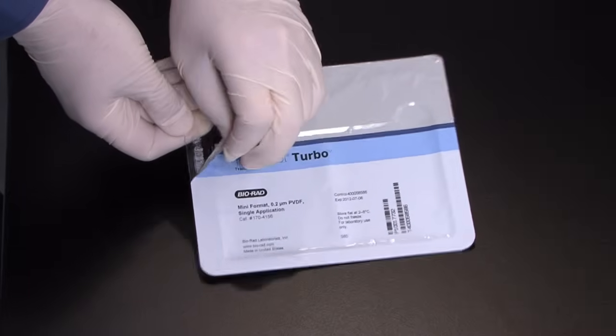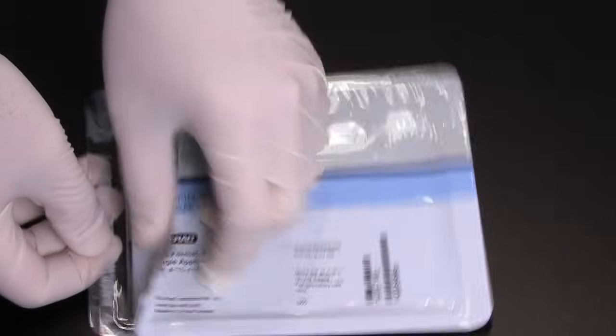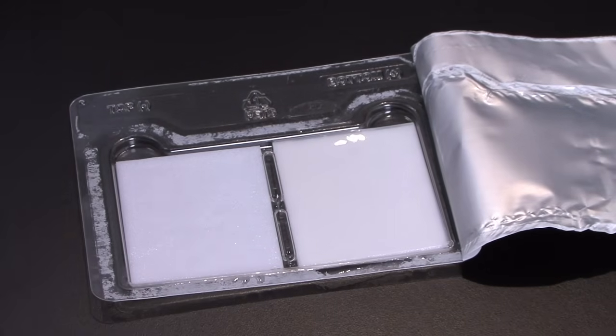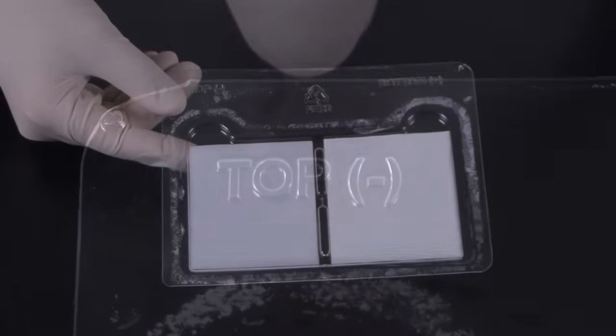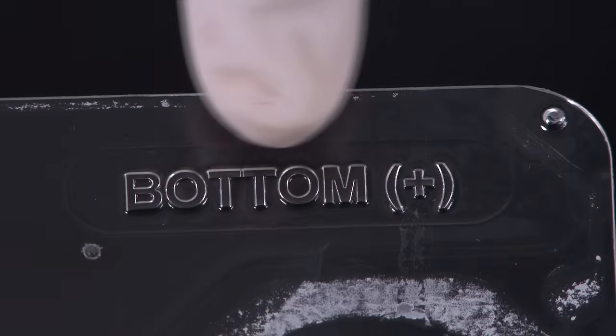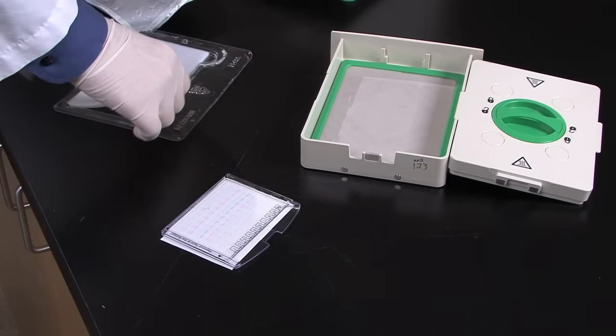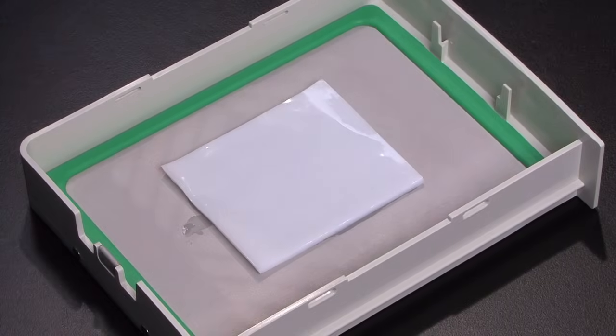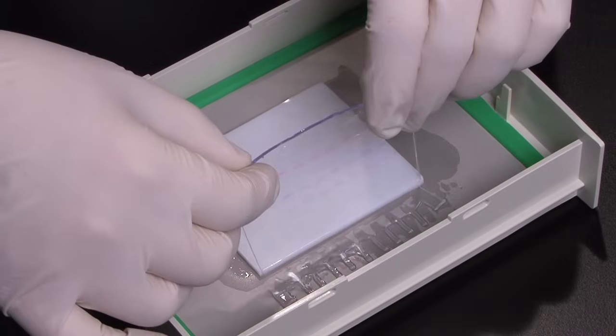To assemble a transfer pack, open it by peeling away the top foil. Here we will use a mini-sized pack. The mini transfer pack tray contains two ion reservoir stacks located side by side. Each stack can be identified by the labeling on the tray. The bottom stack contains the membrane and is placed in the bottom of the cassette with the membrane facing up. Roll the stack and membrane gently with the blot roller to remove any air trapped between the stack and the cassette.